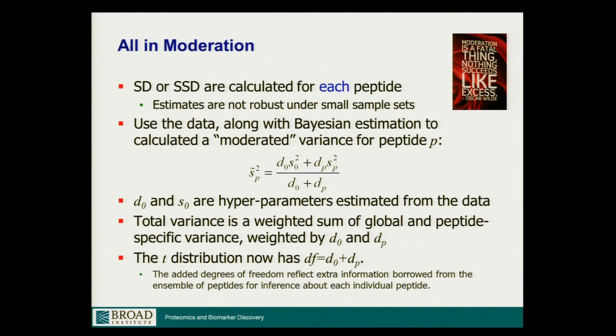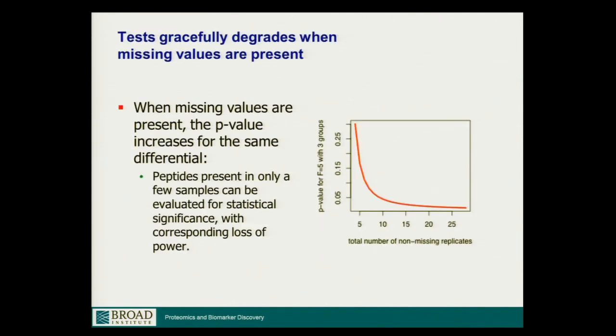When your variance is based on very few values and tends to fluctuate a lot, this reins in the variation in the standard deviation and makes the test statistics that you calculate more robust. So that's what the moderated aspect provides, and we use this in order to account for the small numbers of samples that we have.